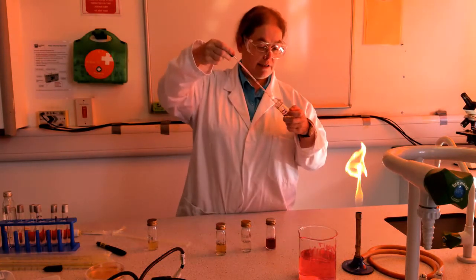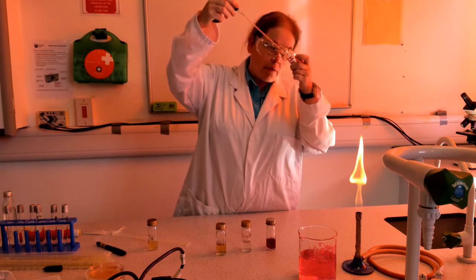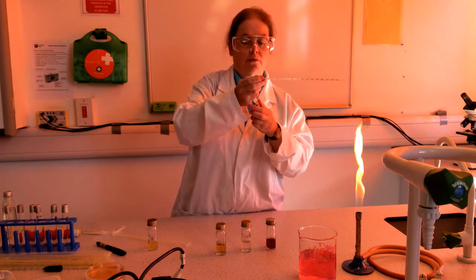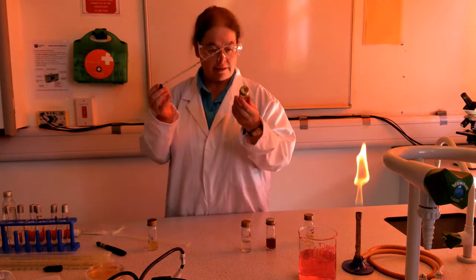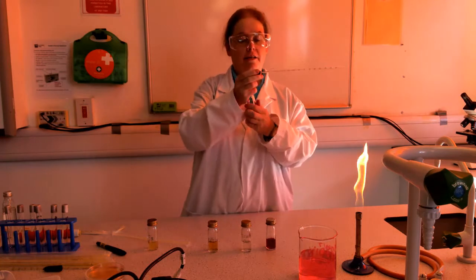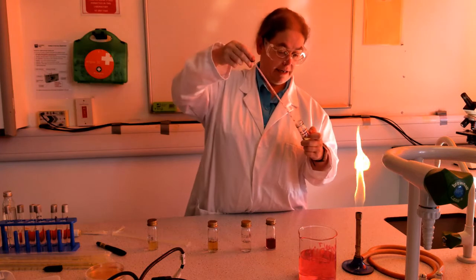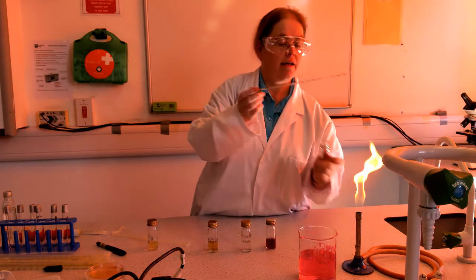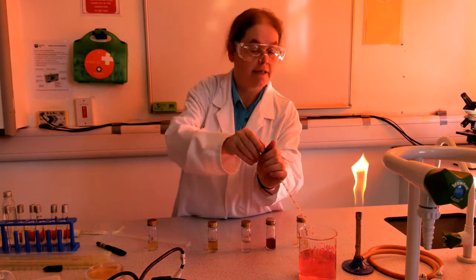Flame the bottle, take up my 0.1 millilitre of bacterial culture, and it's not what I labelled, that's what I labelled. Add it using correct sterile technique to my bottle. Okay, obviously pipette into disinfectant.